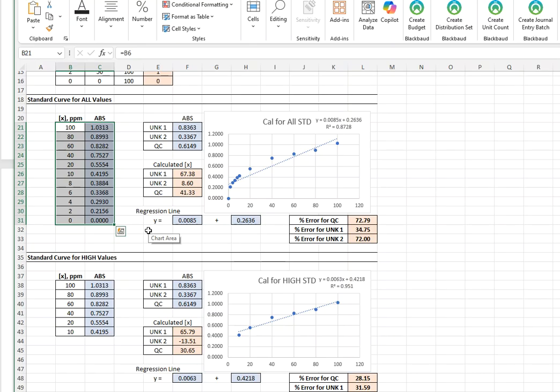So I'm going to plot those numbers, and I'm going to generate a calibration curve. And as you can expect, it really isn't linear at all. I mean, look at that. There is strong curvature that happens with those data points. And this gives me an idea that atomic emission cannot be used on just whatever concentrations that I want to run or that I want to use.